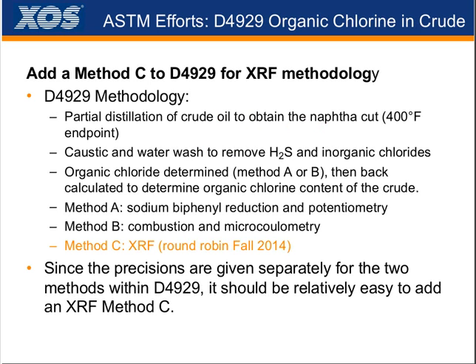And one of the things we're doing right now is working on this D4929 method to add a method C, which would be XRF technology. This is a typical method for measuring organic chlorine in crude. Currently there are a few different ways written in the method: sodium biphenyl reduction, combustion, and MC. What we're looking to do is make it a little simpler for people and just tack on running the final piece on an XRF analyzer, which I know some of the industry is already doing to a certain extent. They're running a version of our aromatics method, which has been modified, but we would like to make it a little more official.